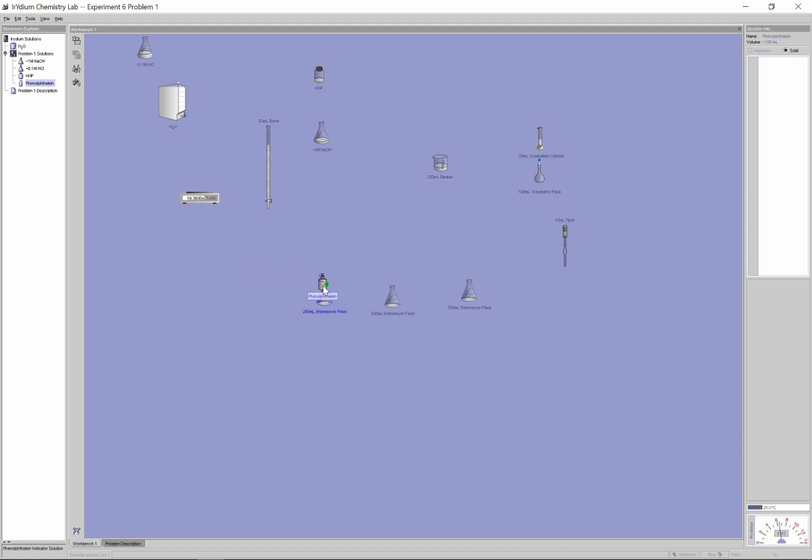So take this phenolphthalein, it already is in liquid. I'm going to pour in, let's say, 3 drops, about 3 milliliters or so. Pour that in. I'm going to transfer it in. The most common problem with the titration is people forget to add in this indicator, and they're like, oh, how come it's not turning pink? It's probably because there's no indicator there. So just make sure you have indicator in all 3. At this point, we're ready. So I'll repeat.